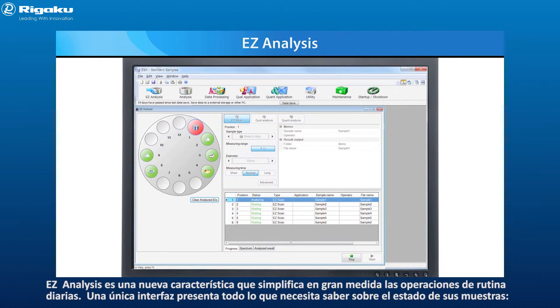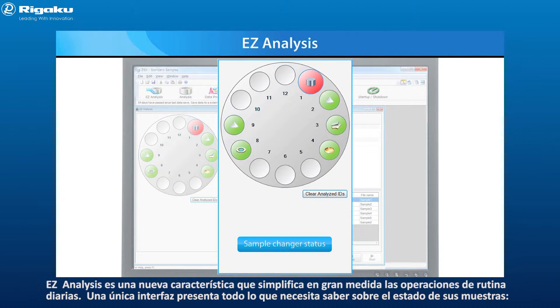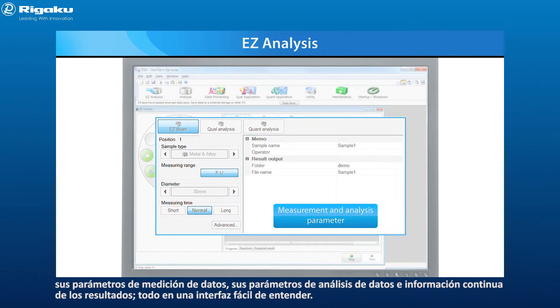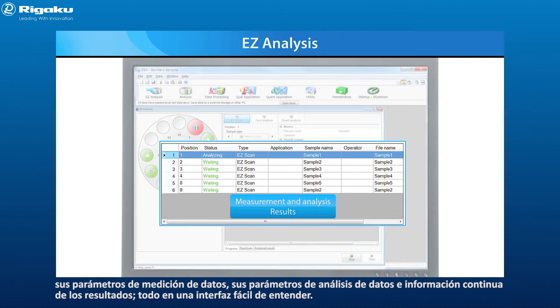Easy Analysis is a new feature that makes everyday routine operations so much simpler. One interface contains everything you need to know about the status of your samples, your data measurement parameters, your data analysis parameters, and a running output of your results — all in one easy-to-understand interface.